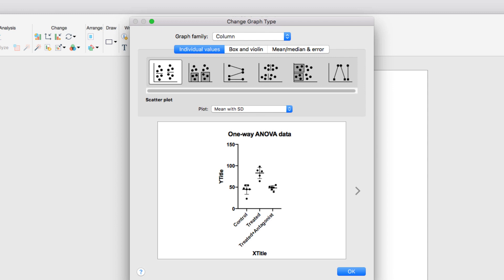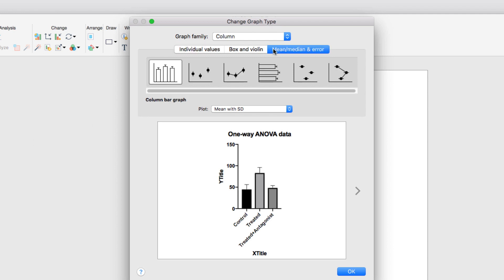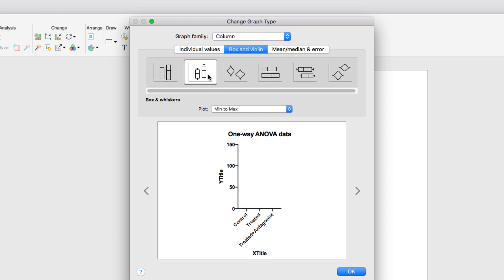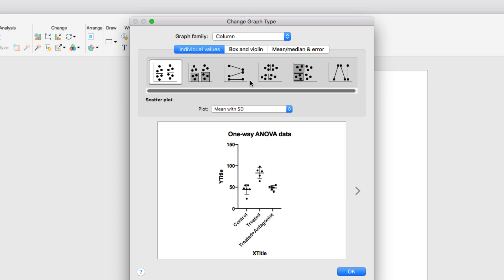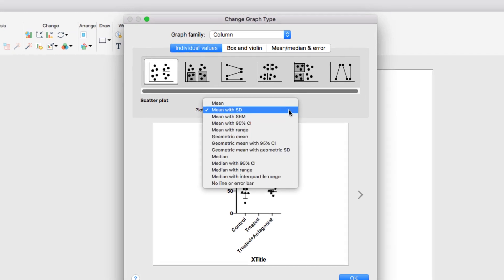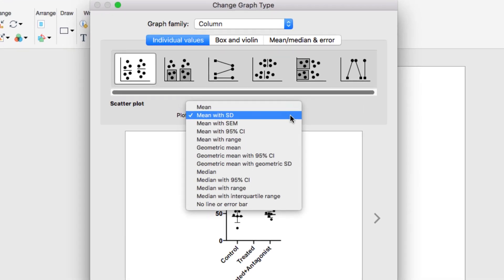For our data that come from a column data table, we can choose to show our data as a simple bar chart, as a box and whisker chart, or a violin plot, or simply as a scatter plot with various options for how to show the mean and error or median and error as you choose.